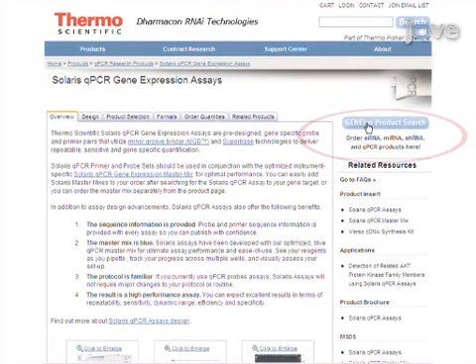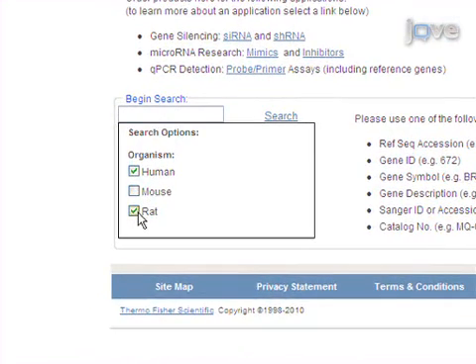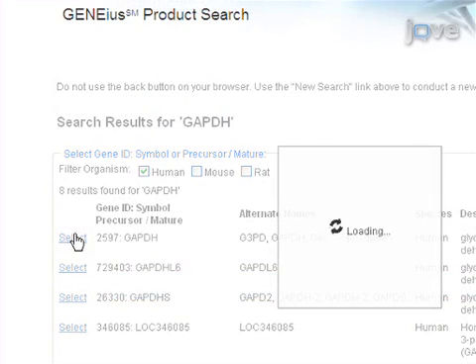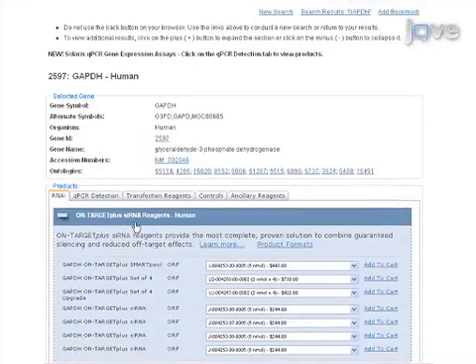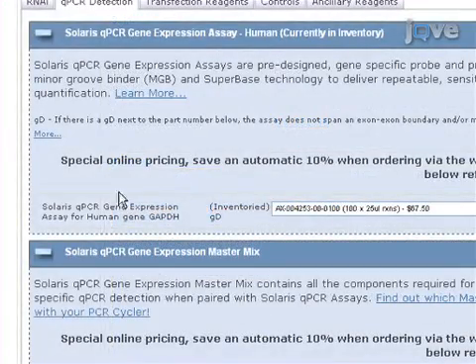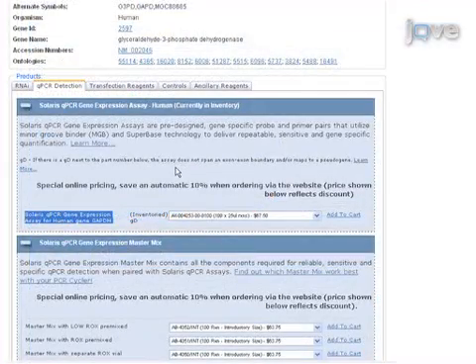To begin planning the qPCR experiment, identify the reagents needed to perform qPCR for the gene of interest using the Genius Product Search, which can be found at thermo.com/Solaris. Click in the search inquiry box and choose the appropriate target organism. The Genius Product Search can process many different gene identifiers. Enter one of the suggested search terms for the gene of interest, then click Search. Identify the gene of interest and click Select on the left-hand side. This will open a window showing the different reagents available. Click on the qPCR detection tab. Under the Solaris Gene Expression Assay heading, one optimally designed Solaris probe primer assay is displayed. This one assay will detect all known splice variants of the gene of interest.